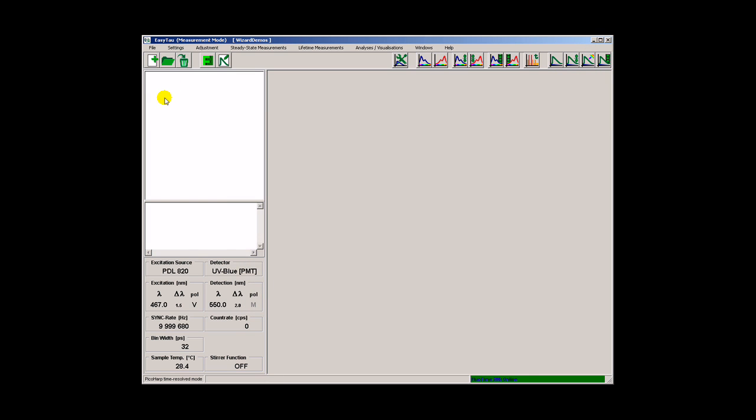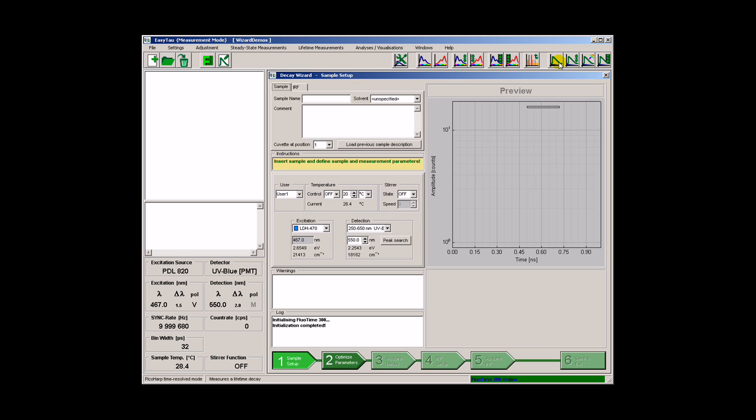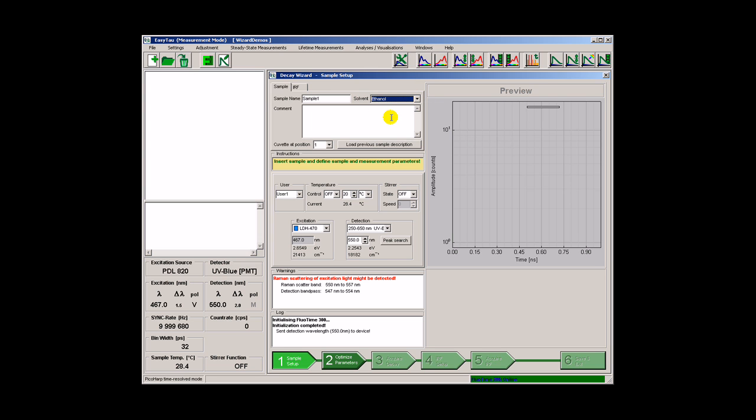We start with an empty workspace and call the appropriate wizard. In the first step one has to define some basic experimental conditions. Let's describe the sample, pick a solvent, choose a username. It is possible to set the sample temperature or to start the stirrer if necessary.